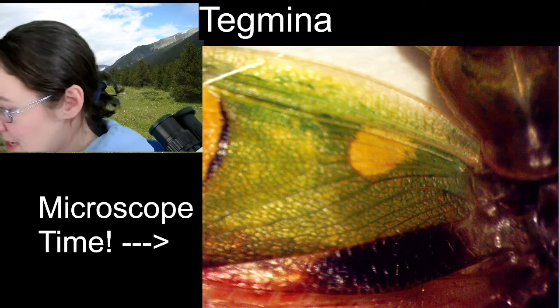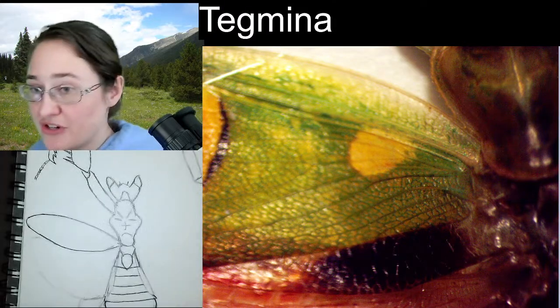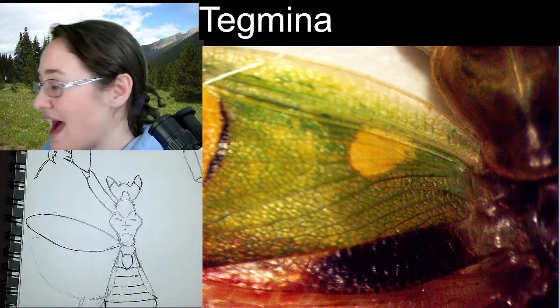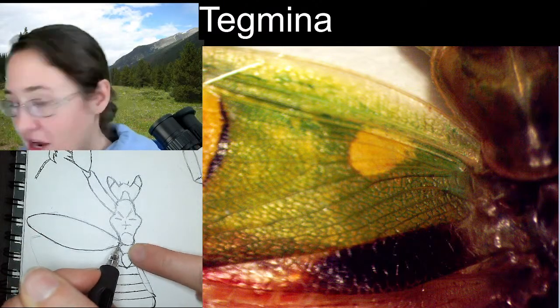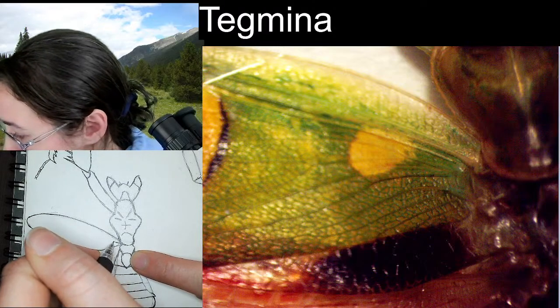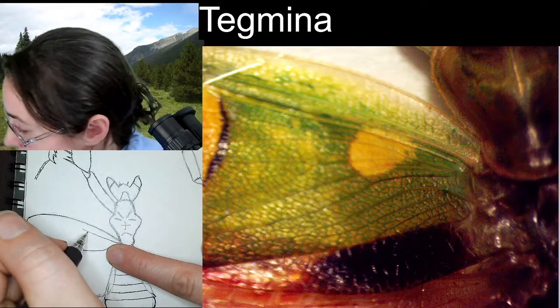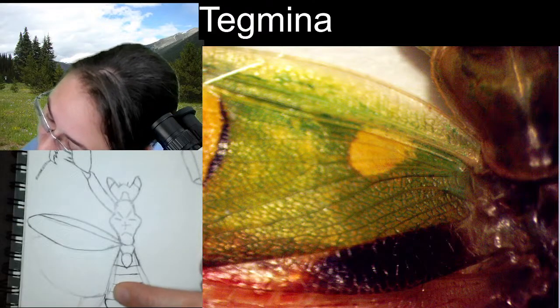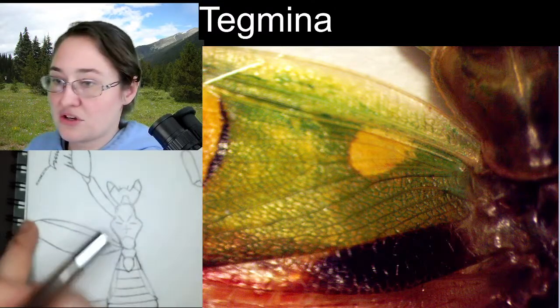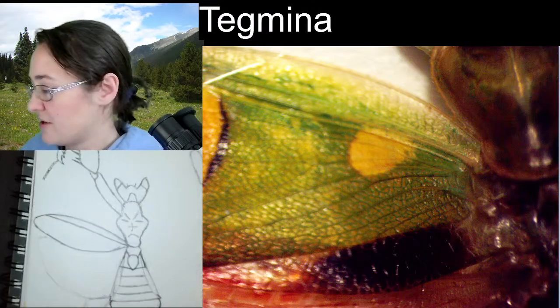So I'm going to make sure that I have at least that vein on my sketch first, before I put the colors in, because I know that that eye doesn't go to the side of the body, it just goes on the top. So, right here from the bottom of our pronotum, I'm going to take this up, give me a small region on the top, and then kind of goes into the edge. And so when that wing closes, that part folds to the lateral.